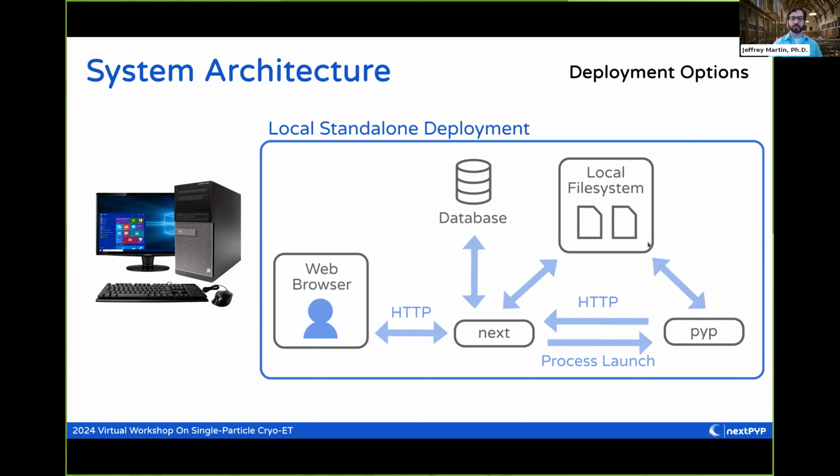They'll share a file system, where we talked about where you need to store all of your huge amounts of data. And then the website has a database where it stores a lot of metadata in a way that is easy to access, often much faster than querying metadata from a file system. And then in this case, you'll have your web browser just on that computer, with your monitor and keyboard, and you'll interact with everything locally.